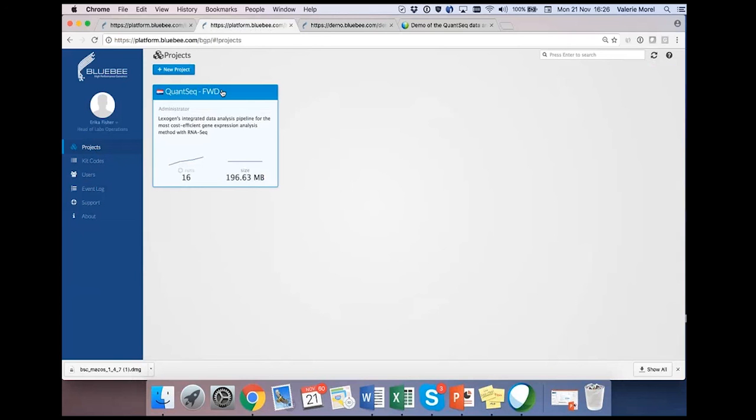Thanks. Is it possible to adjust the analysis pipeline to include TopHat and Cufflinks? It could be, but it will take longer. We wanted the pipeline to work for forward and reverse. Because if you run a forward experiment and afterwards a reverse experiment for QuantSeq, it's hard to compare these two outputs if you want to use TopHat. And with QuantSeq reverse, you cannot use TopHat because of the missing junctions.